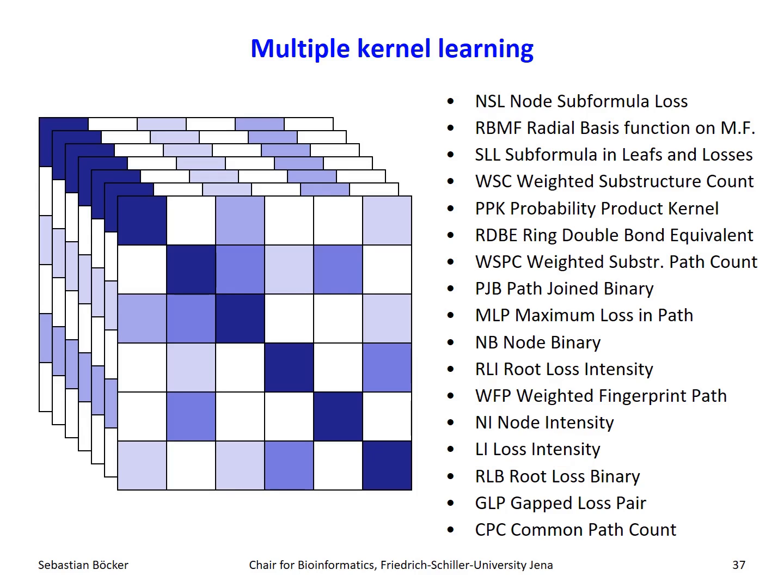And why would you do that? Because sometimes a kernel might do crazy things. It might assume that two mass spectra or the corresponding fragmentation trees are similar, but they are not really. It's just a coincidence. This happens every now and then. But if you add up all of these kernels, statistics comes in, and hopefully such errors cancel out. And this might sound a little bit theoretical, but in fact it's not, and we can actually prove that.